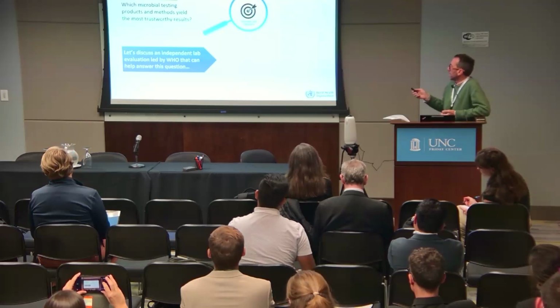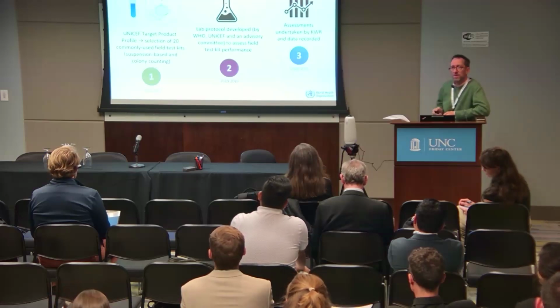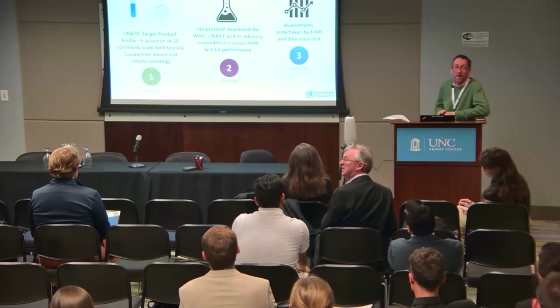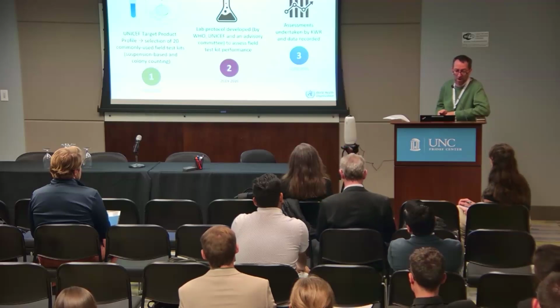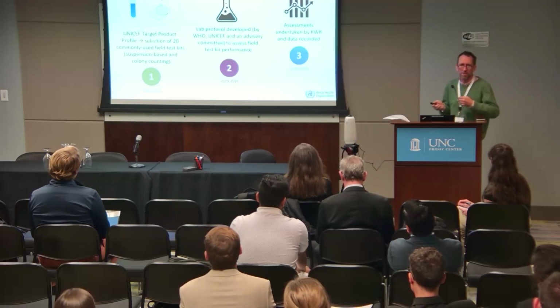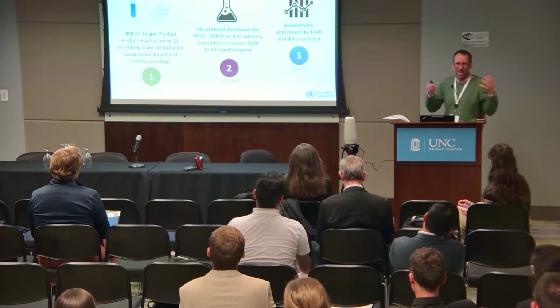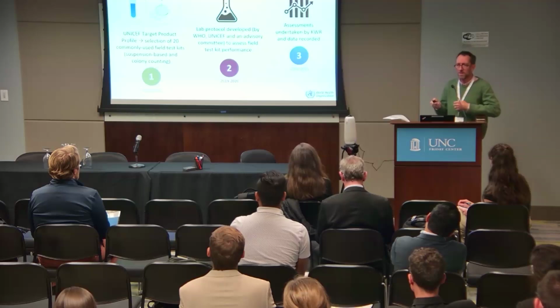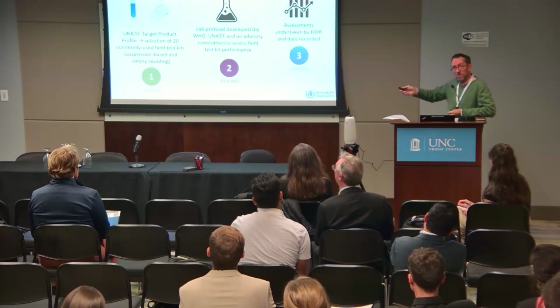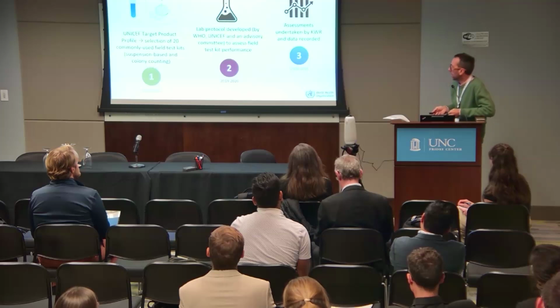What we did is we worked with UNICEF on this over a multi-year program. Back in 2018, UNICEF had a program out of their supply division called a Technical Target Product Profile, a TPP, where they wanted to pull together a bunch of manufacturers of testing equipment to say, this is our ideal scenario. Do you have anything like it now, or could you possibly work towards something like that? That led to a lot of bilateral discussions with different producers, both about products that exist and things that might be in the pipeline.